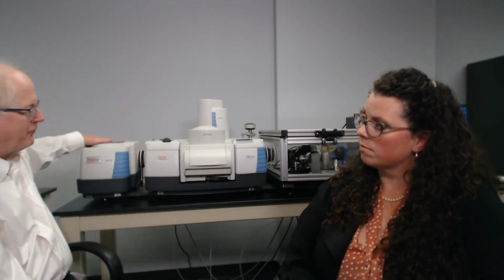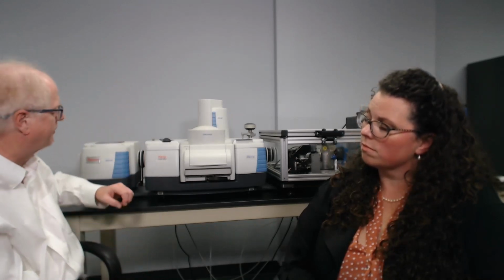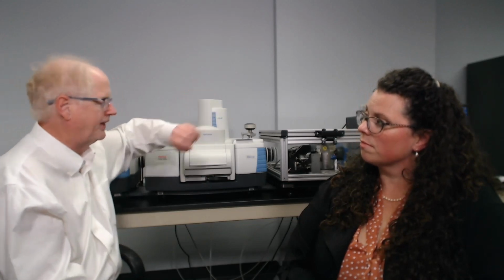In this case, we also have a near-infrared module mounted on the side with an external beam. And again, you need a different beam splitter for that. And again, the automatic beam splitter changer can deliver. We have a Raman module, which also needs a different beam splitter. And again, the ABEX allows you to automatically configure all of that.